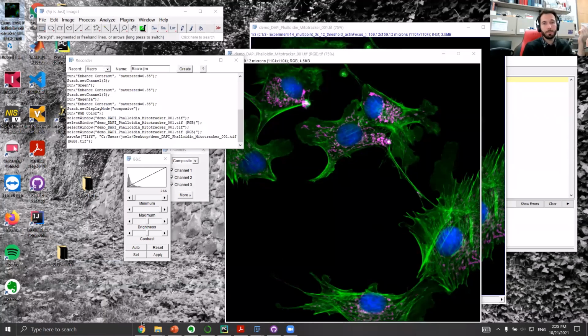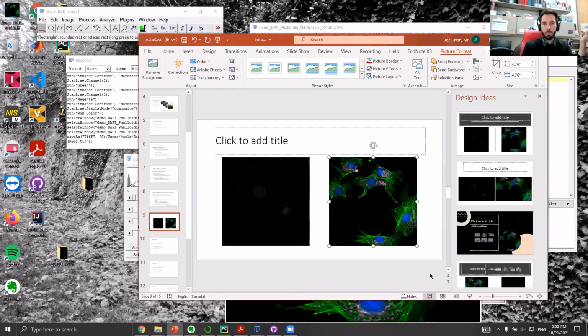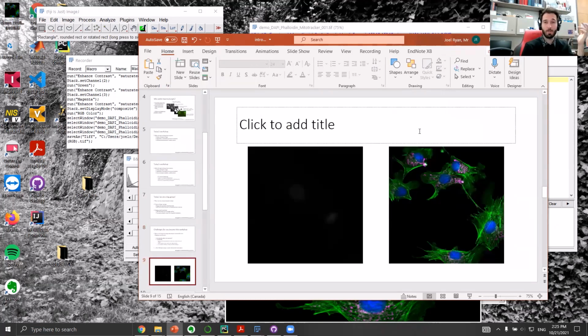And then somewhere on the desktop, I should have that file. Oh, it just appeared up here. And so that's kind of convenient. It's a good question, Jot. I'll get to that in a second. Already this TIFF file here should be better. So I can just drag it into PowerPoint and already right there, you know, oops. Microsoft is trying to be helpful. Now PowerPoint can read it, which is very, very handy.